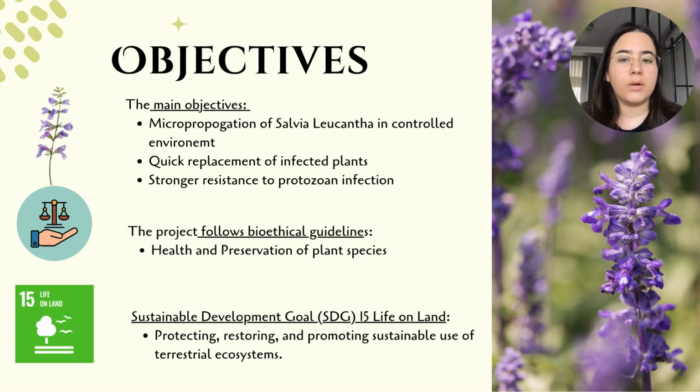And as well, we wanted to play a little with the medium in which we grow the plant, so we could find the best media or the best combination of hormones to increase these compounds or secondary metabolites and make the plant more resistant to protozoan infection.